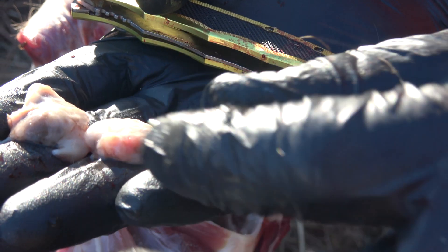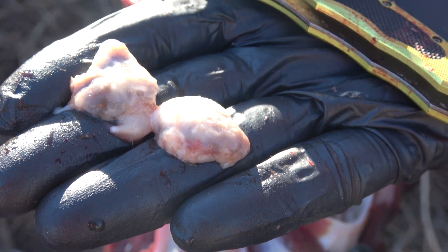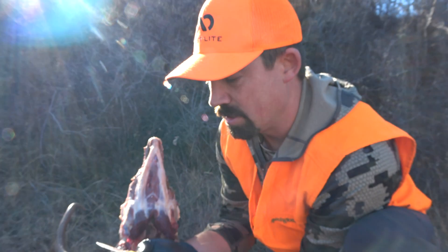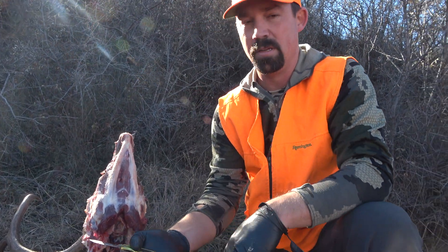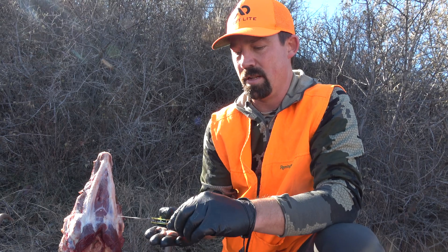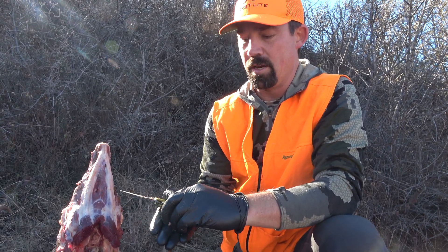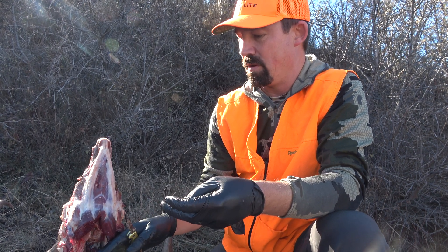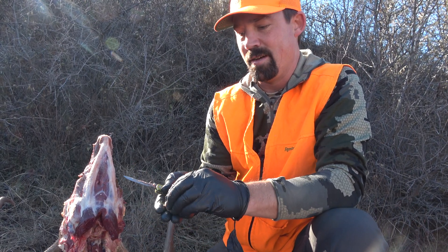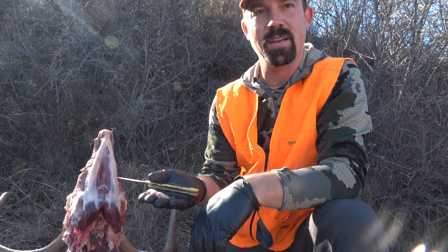They'd like to have two if they can; if you could only find one, just do one, but they really like when you find both and send them in to get tested. It's good data for the Game and Fish and lets them know how their CWD is going in the state. A lot of states recommend taking those in — there are a lot of deer head collection sites where you can drop off the whole head, but we're just going to take them ourselves, put them in a little baggie, and send them in to get tested.